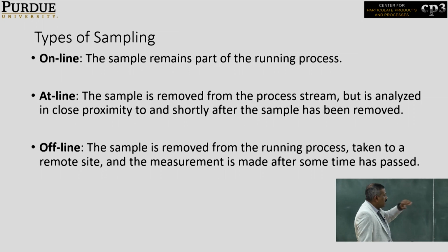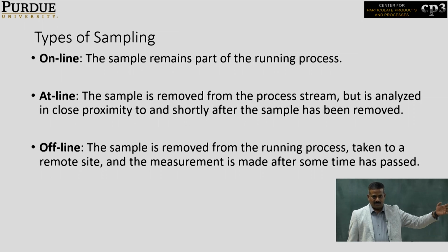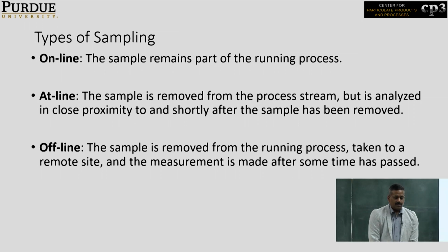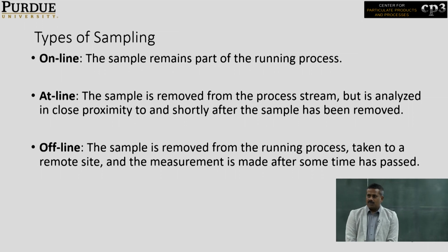Okay. Offline is most common when you want to do a thorough investigation of the characteristics. You take the sample, store it in the lab, and most often you keep the samples for a longer duration, like 3 years, 5 years, etc., till you need them. You know about grain grading, grain trading, etc., right?